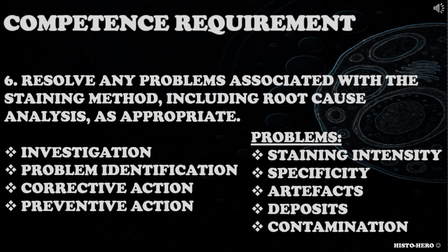The sixth competence requirement is for you to resolve any problems associated with the staining method, including root cause analysis, as appropriate. What are the common problems associated with H&E staining? How would you resolve them? How would you record them? Consider investigation, problem identification, corrective actions to fix the issue, preventive actions to minimize problems from reoccurring.